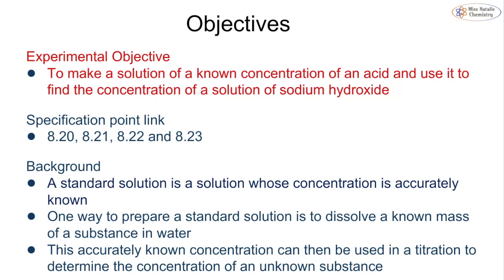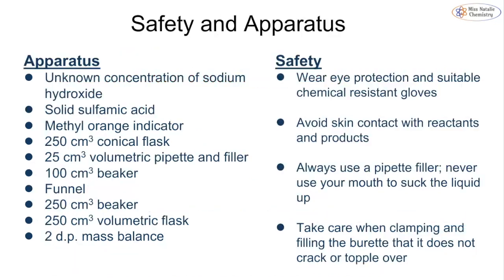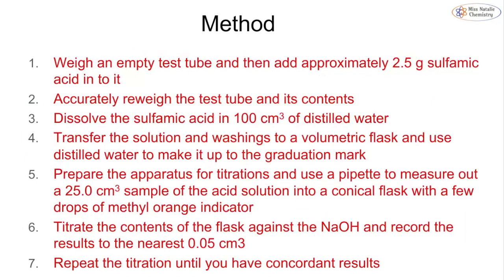So we need to know the definition of a standard solution. A standard solution is one whose concentration is accurately known. And the most common way that we prepare them is by dissolving a known mass of substance in water, and we can use that to then accurately determine our concentration. So let's look at how we actually do this.